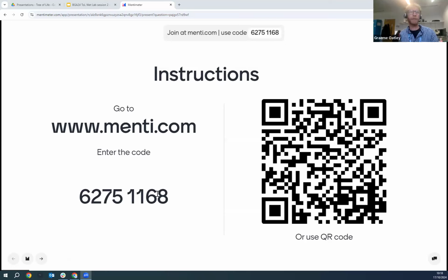We will be going through some Femtos and yields of some extractions that we've done in the core lab, and I'll ask you to make a decision on how you would proceed with the sample. I'll give you maybe a minute or so to get set up, and then we can start. If everyone can give a thumbs up once they've been able to log on, then we can.